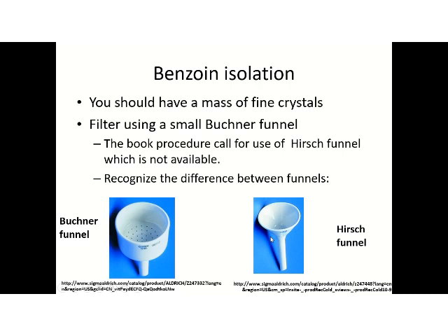If you study the causes and what can increase crystallization and the growth of crystals, or the generation of many nuclei with small crystals, then you should notice that this architecture for this funnel is preferable for this purpose, right? But it's not a problem to use this one as well.